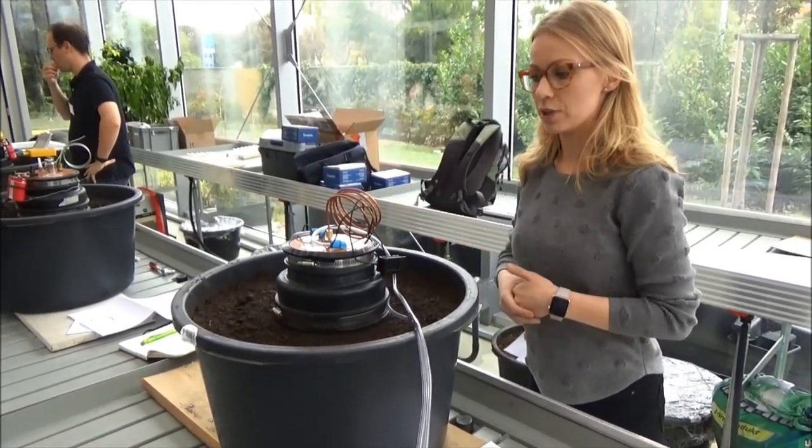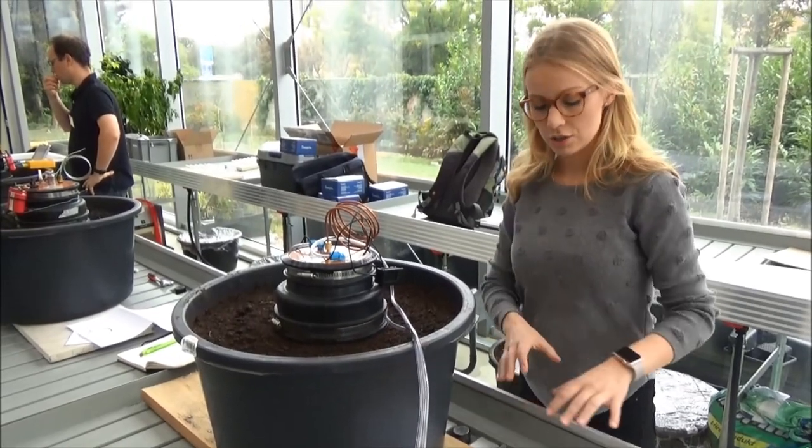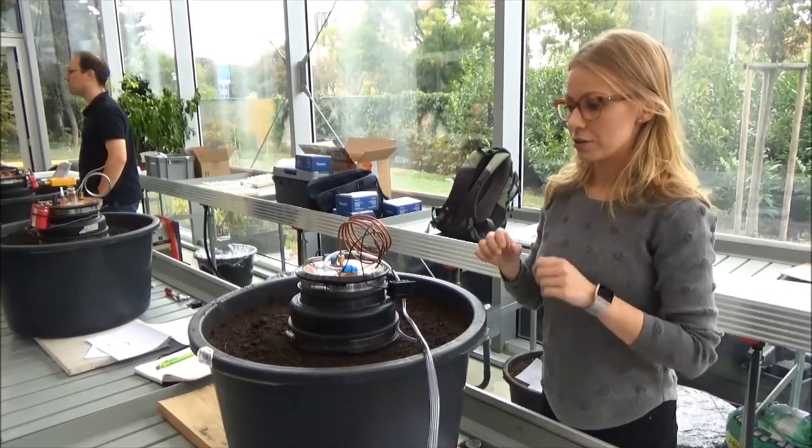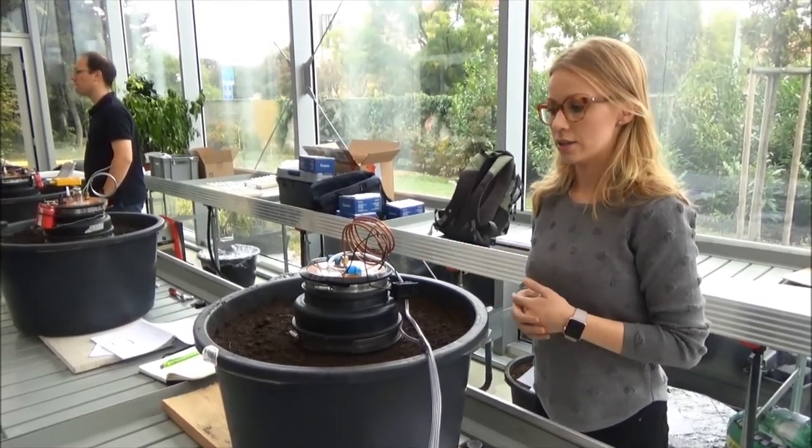We are now measuring it with the GASMA DX4050. So this is a peat sample, and there is no fan in this chamber.